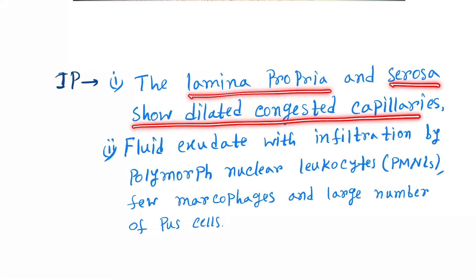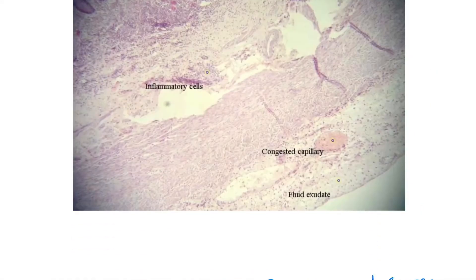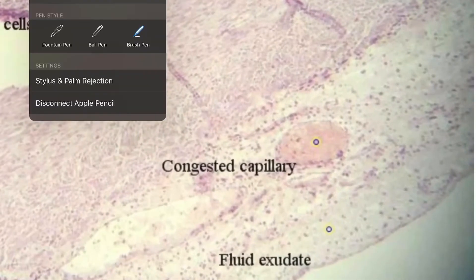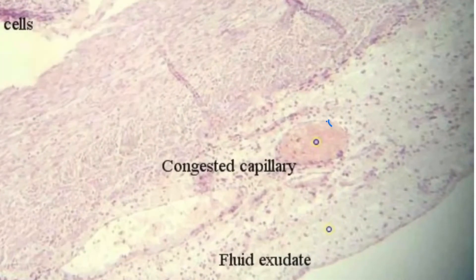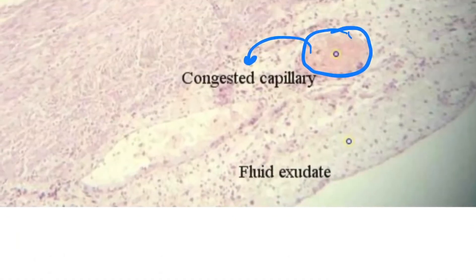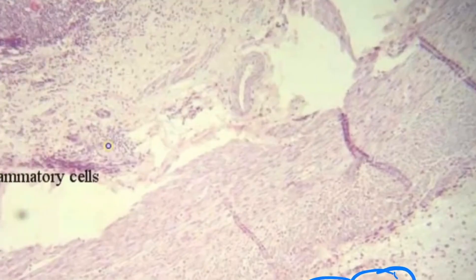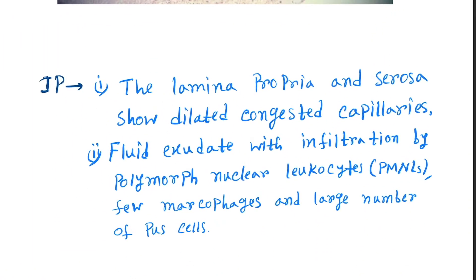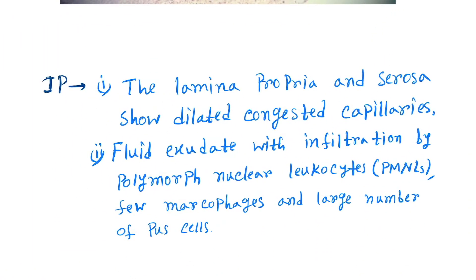The next picture shows the lamina propria and serosa with dilated congested capillaries. Here you can see this is a congested capillary, and here is another congested capillary.